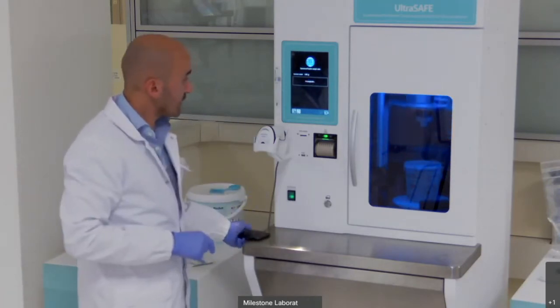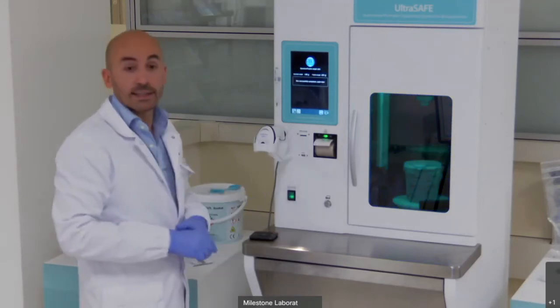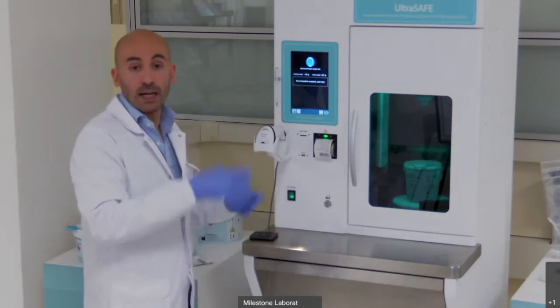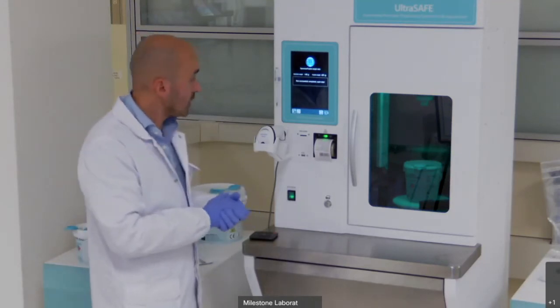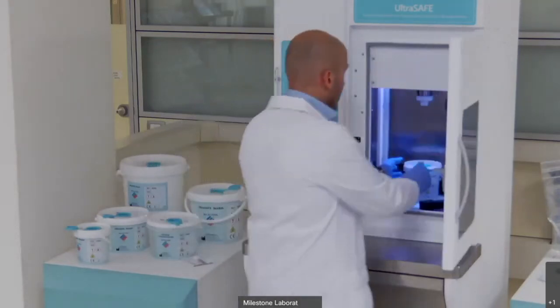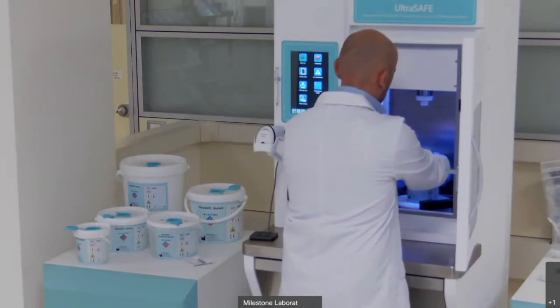The procedure is now terminated, and I get a label with all the information. Before attaching this information to the bucket, the user simply needs to close the bucket inside the cavity.